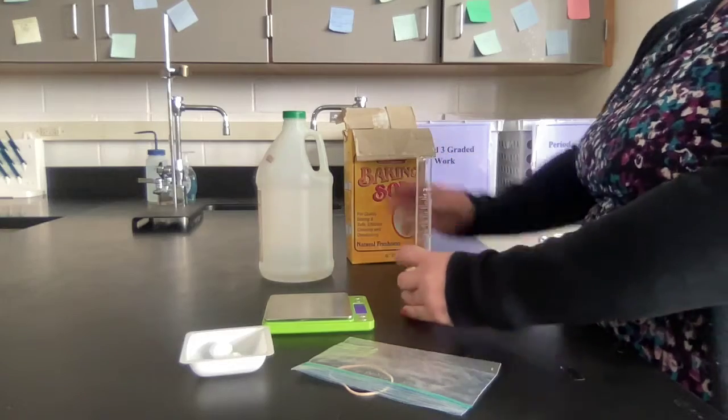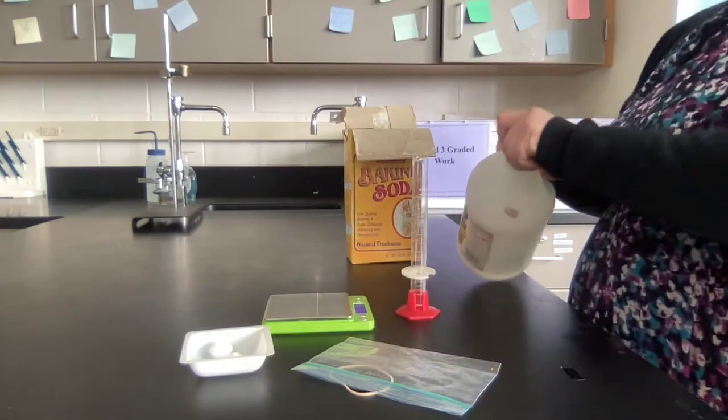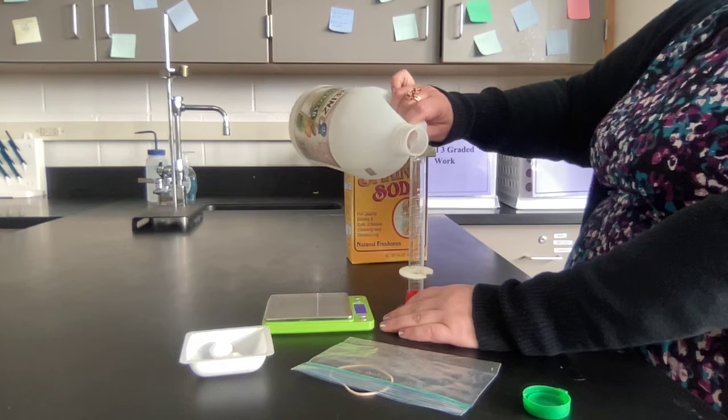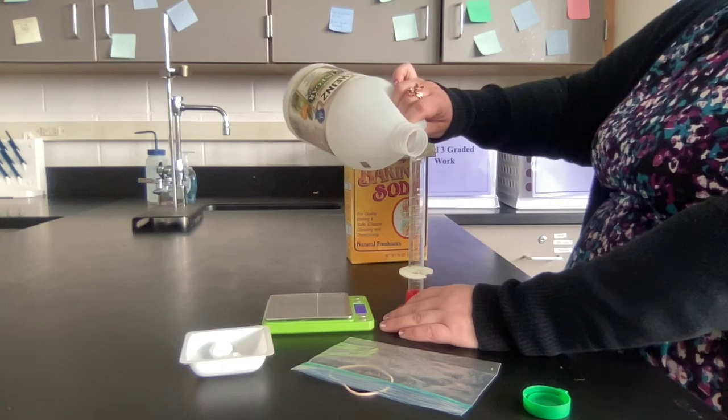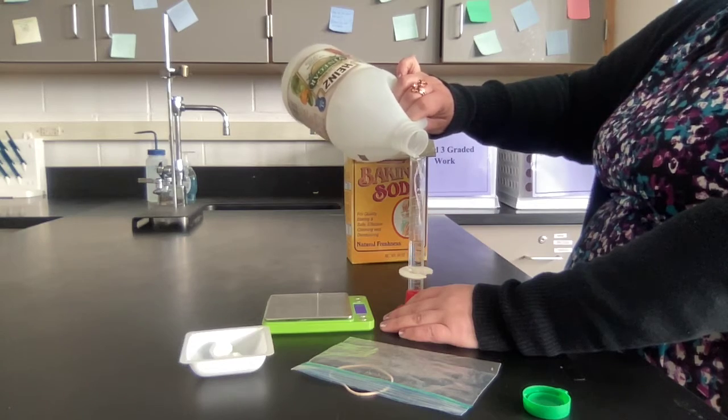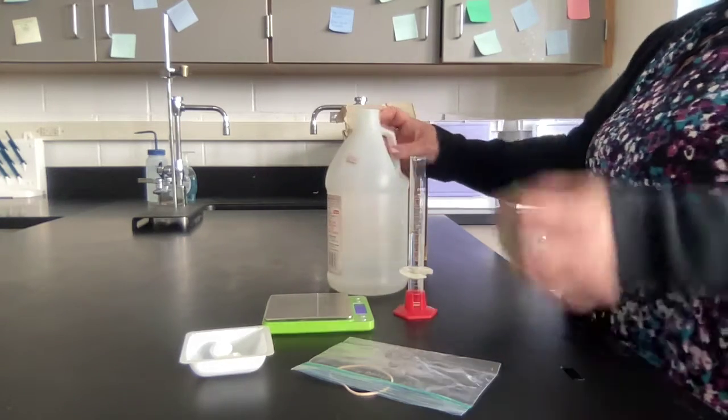Next thing you're going to do is take your graduated cylinder with your vinegar and measure out the correct amount of vinegar. And again, you'll have an amount, you'll be precise.